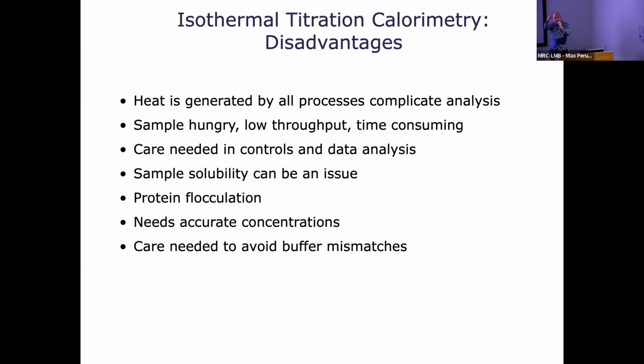Because you're injecting one sample into another, again, you need buffers to match completely, and that can be a problem if you've got small molecules. You also need everything to be very, very clean. So you have to hope the person who was there before you didn't just aggregate the protein in and just leave it. So it's very important to make sure you wash out the stuff.